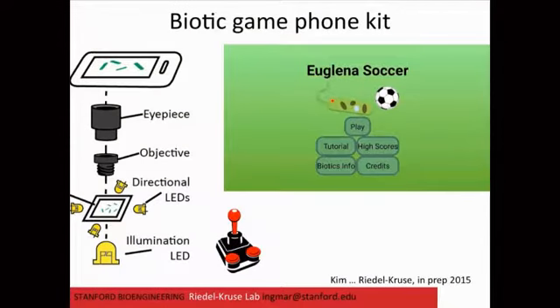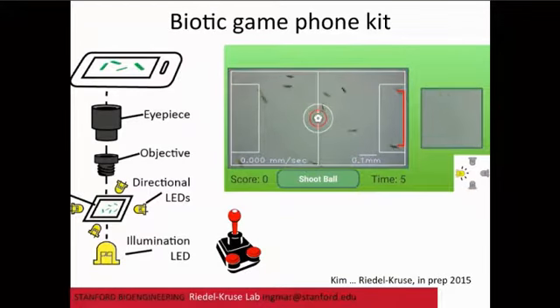So on this phone setup, the games that we implemented have a very similar setup as before, but instead of electrodes, we now have LEDs, and light is much easier to control in many aspects, right? What you see, a few differences to the games I showed you before. It's in color, right? So we made some advancement there. Which you may not appreciate is that these cells now live for a couple of days in this chamber, so you almost get a plug-and-play experience, right? You turn the thing on, you can play, and then you can turn it off again.